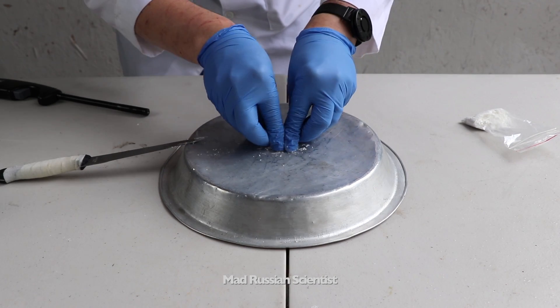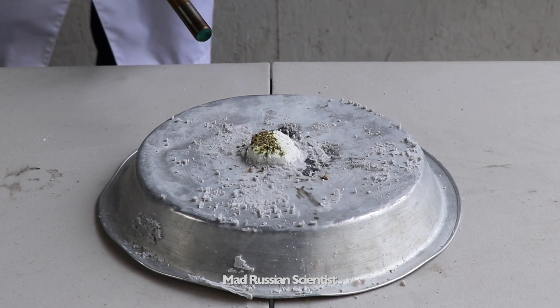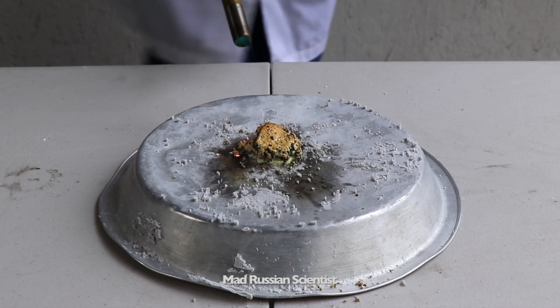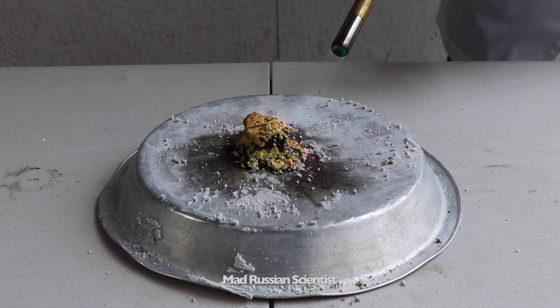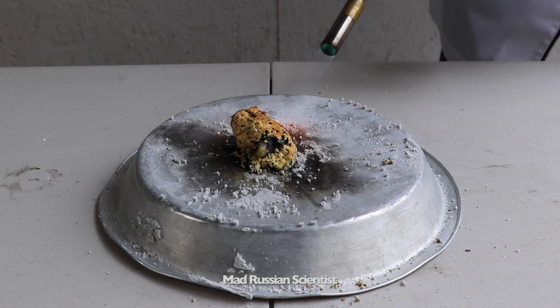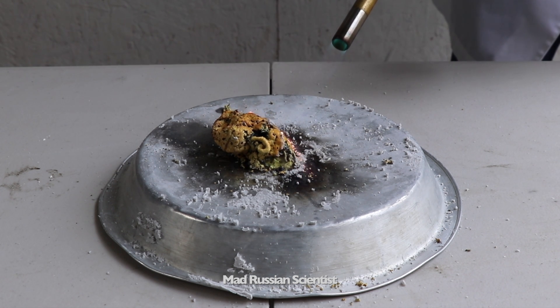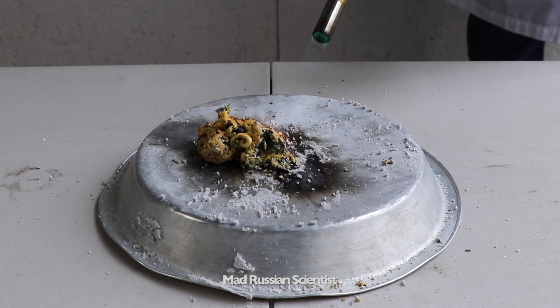So I'm gonna make just a little pile so it can hold together. Let's check it out. Hopefully it's gonna work. Look at that. That's crazy.